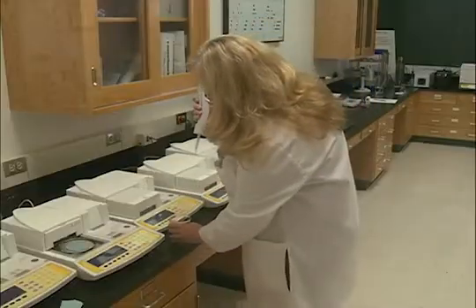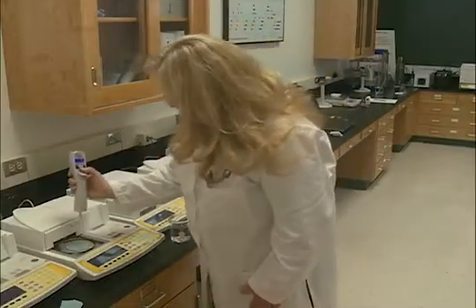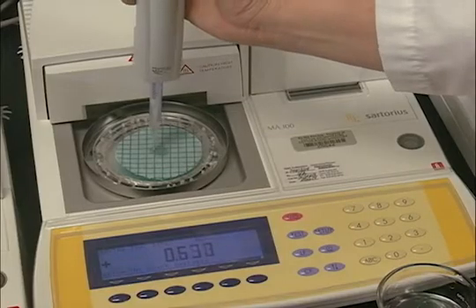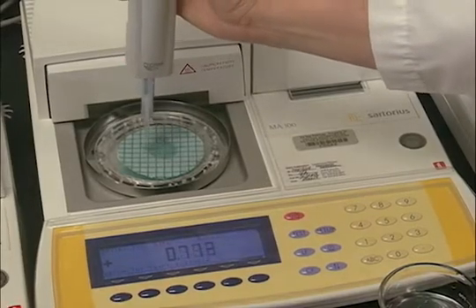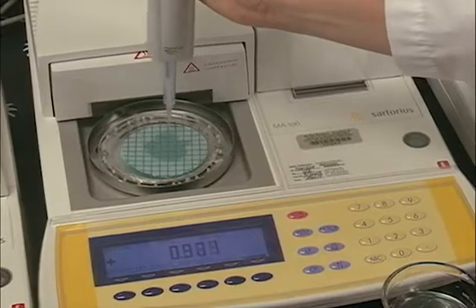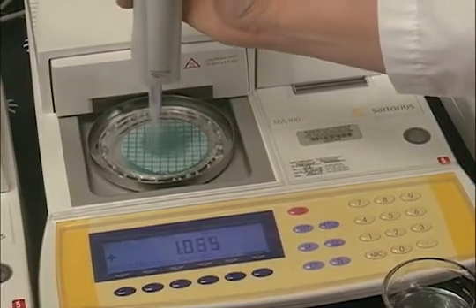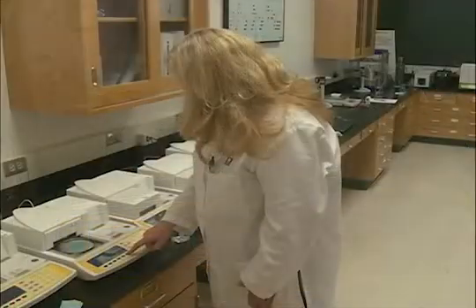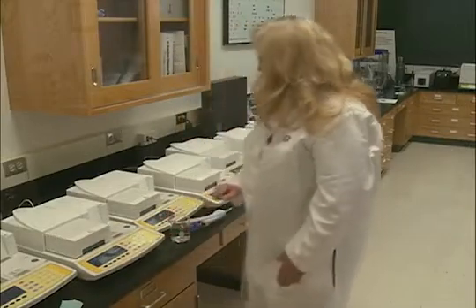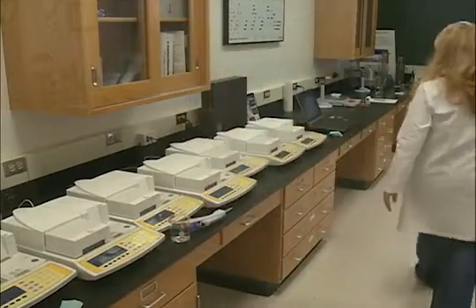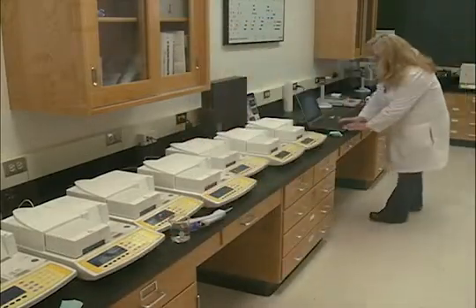For Test Method 199, a fixed amount of water is applied to a test specimen that is then dried at 37 degrees Celsius, which simulates the body temperature at which perspiration starts. The heating element of a moisture analyzer allows for other temperatures to be selected to simulate other conditions to which a garment might be exposed.